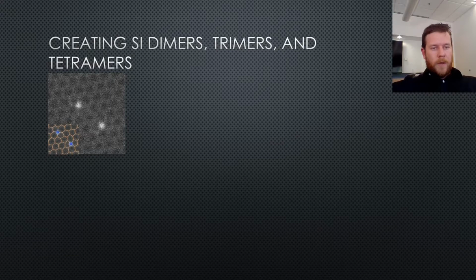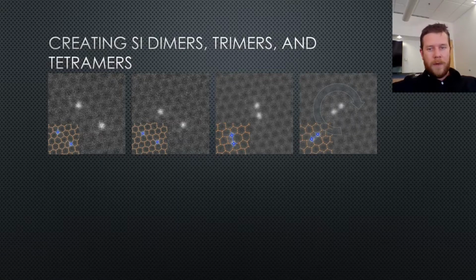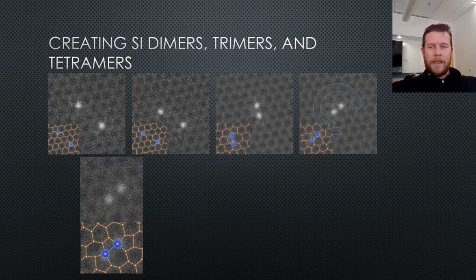So I told you I'm going to show you how we can form that initial structure. If we have 2 fourfold coordinated silicon atoms, in other words attached to 4 carbons, and we bring these guys together, they form that initial structure from the last slide. This structure can be rotated with the beam. And then I was just trying to capture a more clear image of this configuration.